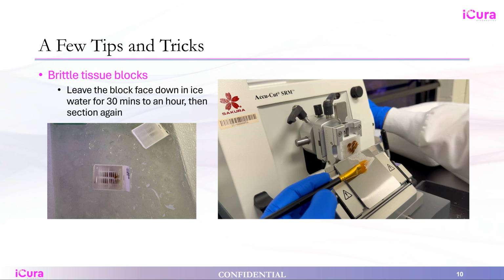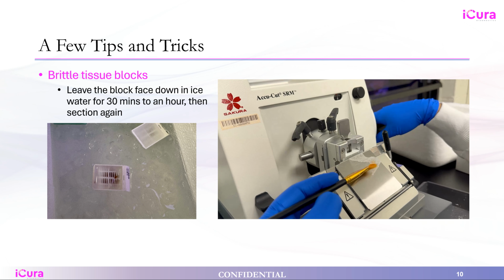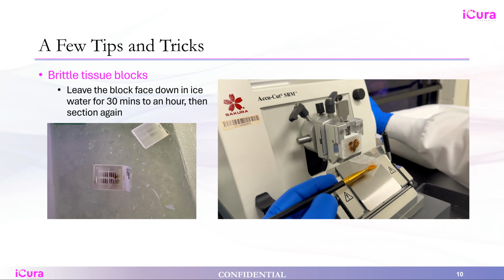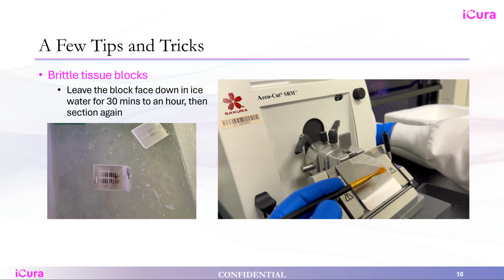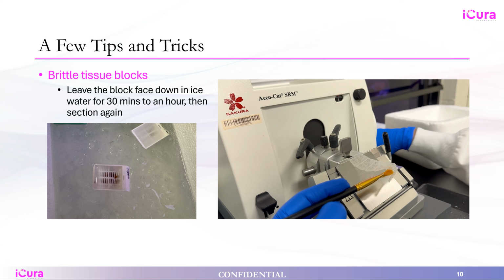So as you can see in this video, we have soaked this exact same block we showed in the previous video in the ice water bath, and now it's giving you very nice continuous ribbons with intact tissue in it.